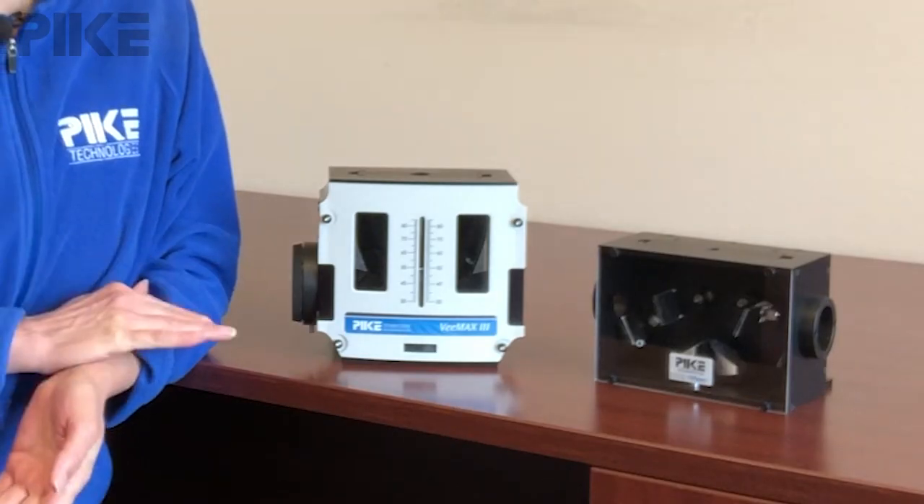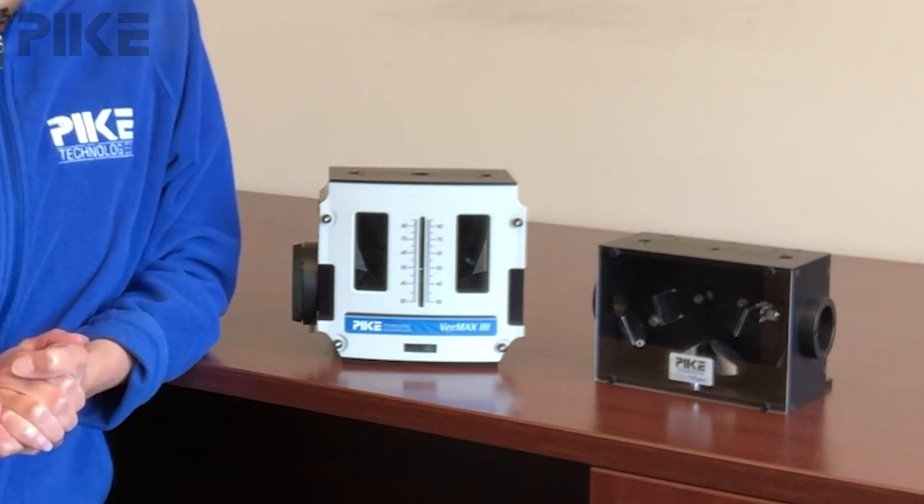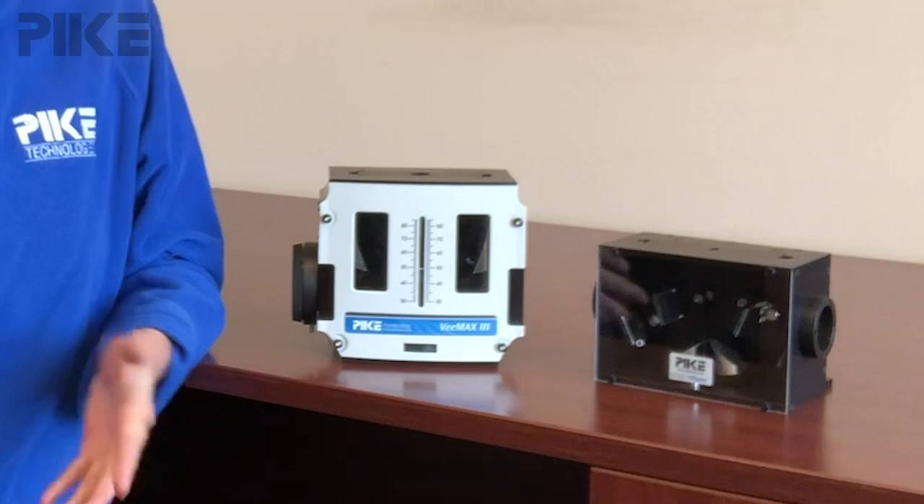I brought two specular accessories with me today. One is the variable angle VMAX, and the other is the fixed 10-degree angle of incidence 10 spec.